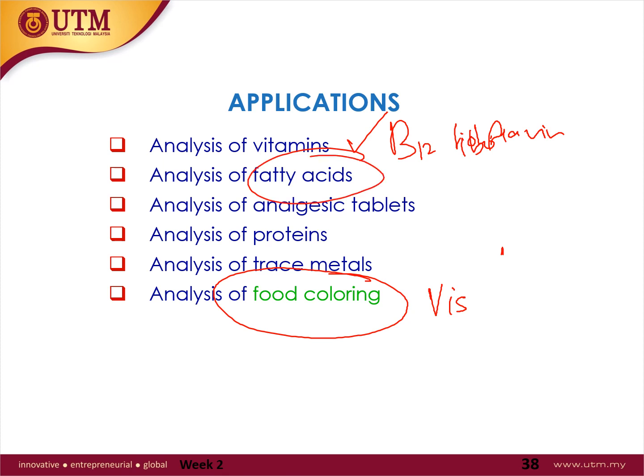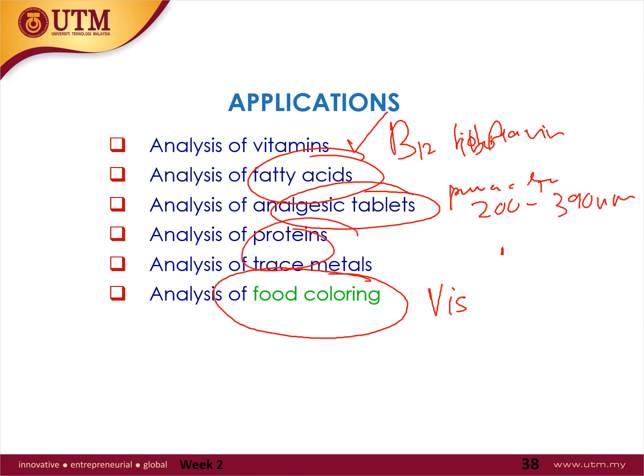Fatty acid, analgesic tablets such as paracetamol, paracetamol is colorless, so you can expect that the analysis is between 200 to 390 nanometer. Protein is also colorless.